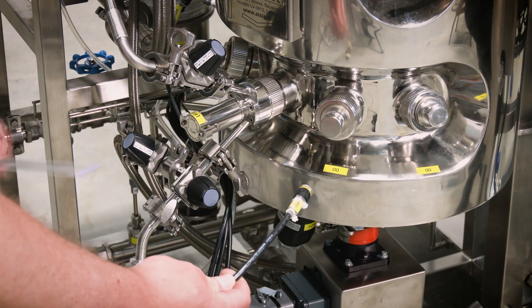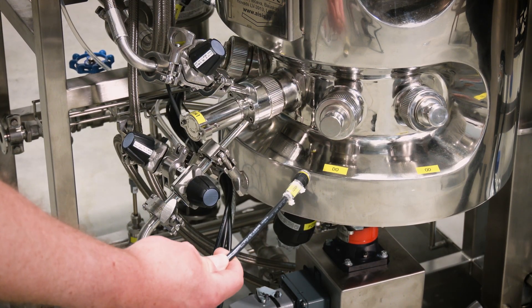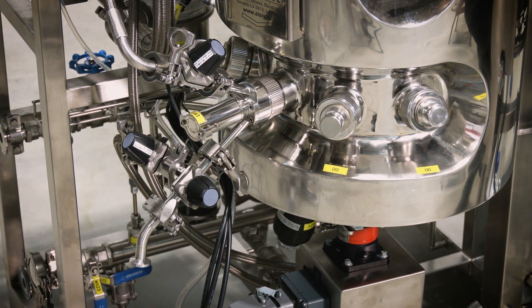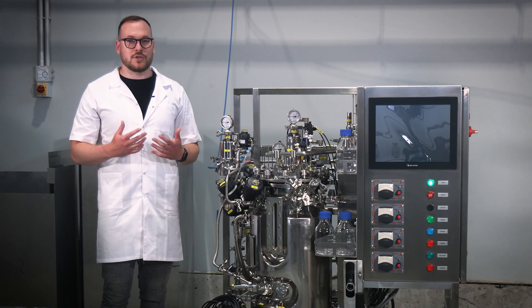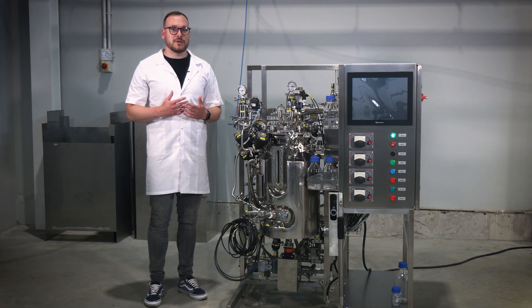Step 12. Attach the temperature, pH, dissolved oxygen, pressure, upper level, foam level, and optical density sensors to the respective cables and ensure proper alignment and secure connections. Note: the air supply to the bioreactor should come from a clean and dry source. Contamination from water and oil particles may lead to filter failure or system malfunction.